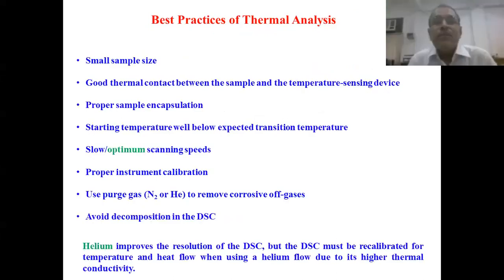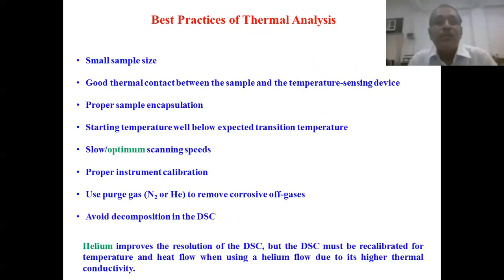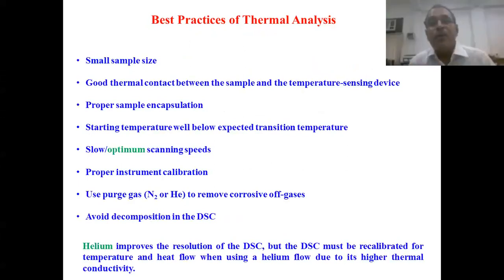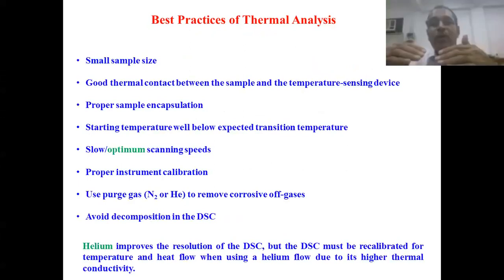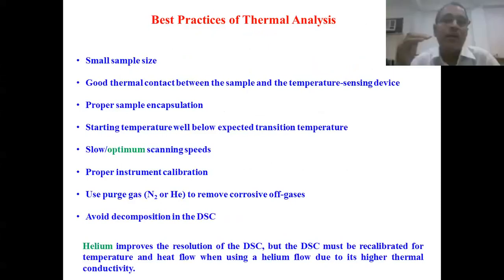In the case of thermal analysis, the best thing is that it needs a very small sample size. The best practice is that good thermal contact is needed between the sample and pan, and between the pan and oven. So all the time you should keep them very neat and clean. You should thoroughly clean before starting your experiment. You need proper sample encapsulation. Different kinds of pan holders are available for solid material, for liquid material, and for materials which may vaporize.